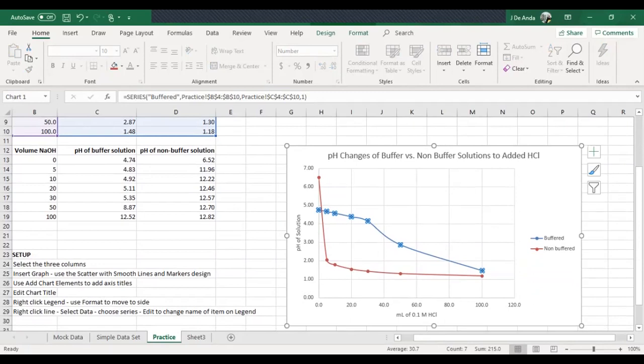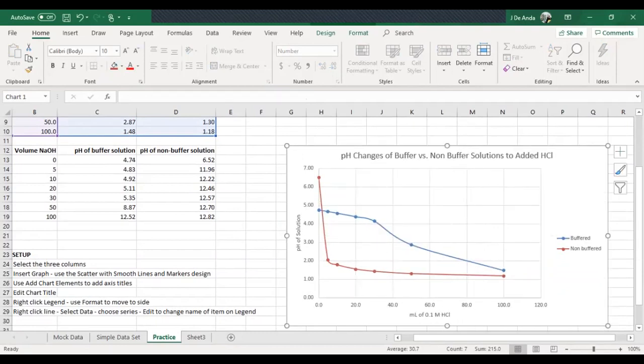All right. Again, I don't know if this is the same data that you have in there. I might have just done the graph for you. So again, if you want to spread it out a little more, just open the box here. And remember, you need to have 2 of these sets of data. I mean, 2 of these graphs.